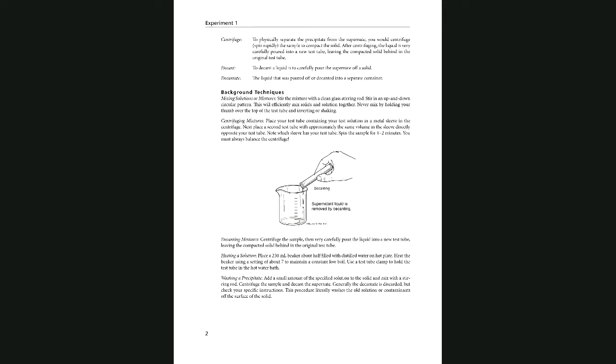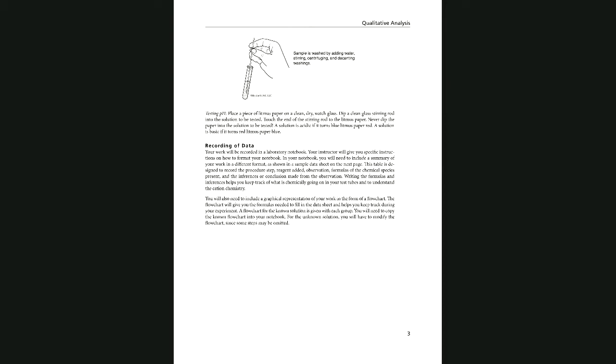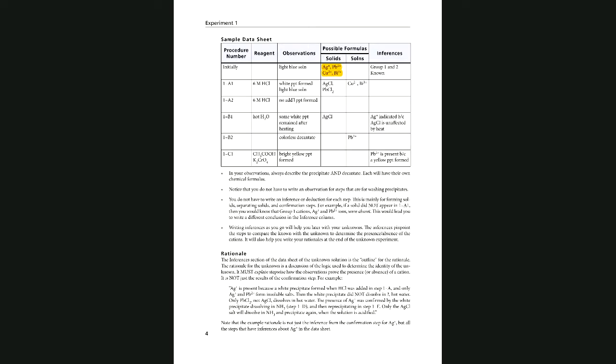The lack of evidence is proof that an ion is not there in the unknown. We are going to learn some lab techniques like precipitation and selective precipitation, and other theory that goes with the lecture. You also learn in lecture about selective precipitation, where only certain ions precipitate when you add chloride, because chlorides are all soluble except for silver, mercury, and lead.